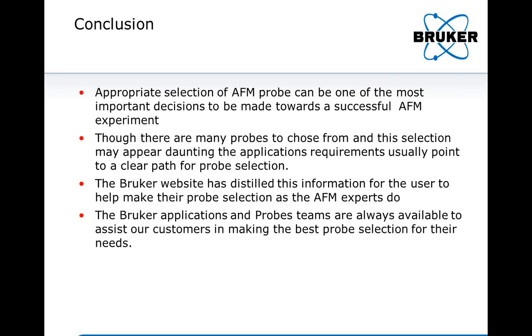So to answer the first part, it would be a TAP525 or an RTESPA probe. Use the graph for a real quick reference, as it should be in the manual. For the substrate, silicon mounted on a magnetic puck is a good place to start. And yes, if you want accurate results, you really do need to perform an accurate calibration.